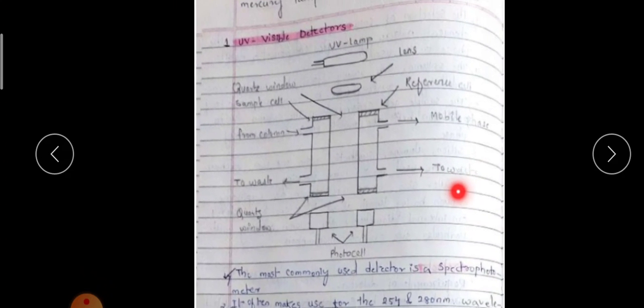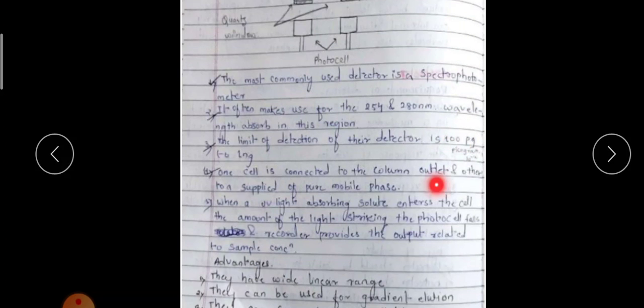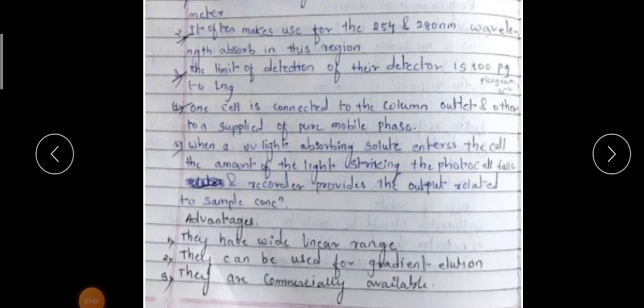This is a very simple detector, as shown in the diagram. You have to mainly focus on the limit of detection for the UV-visible detector, as that will come in the MCQs. You should remember these things. This detector is also used for gradient elution, and it is simple and commercially available. You have to remember that.